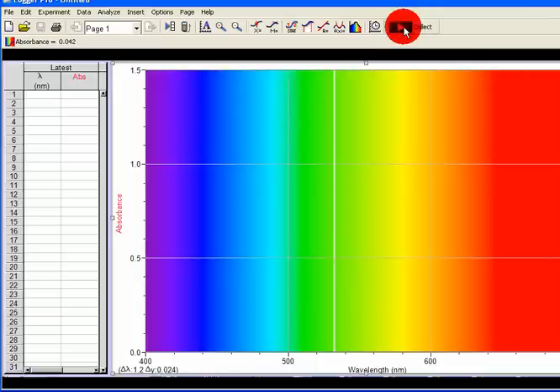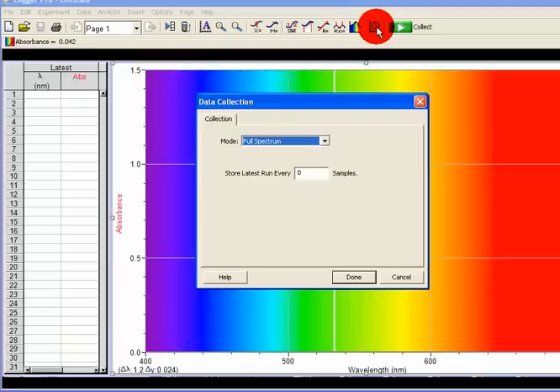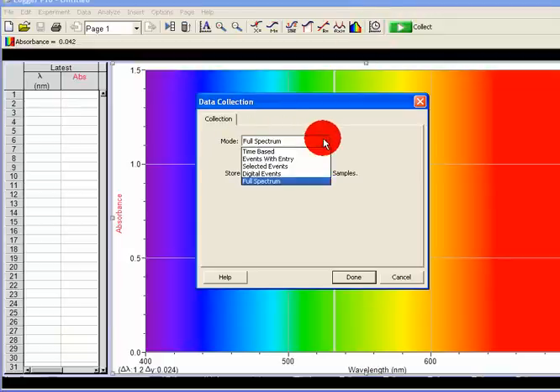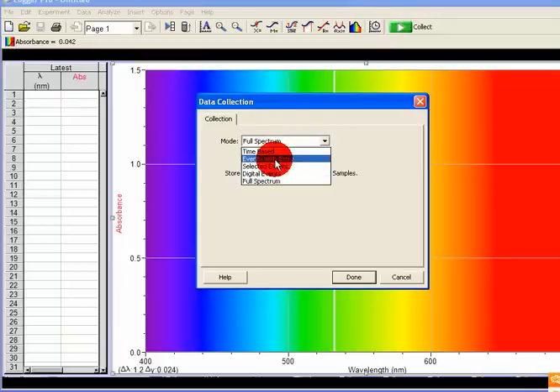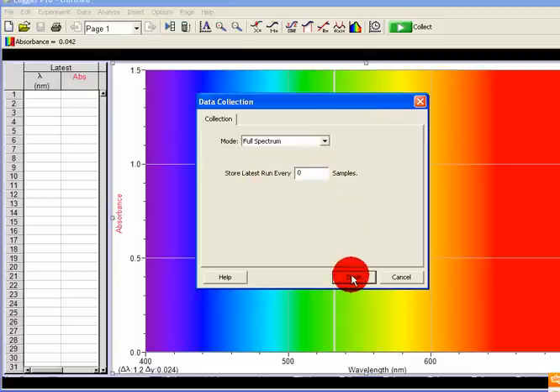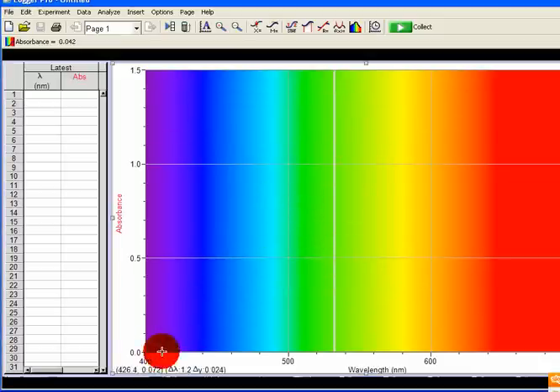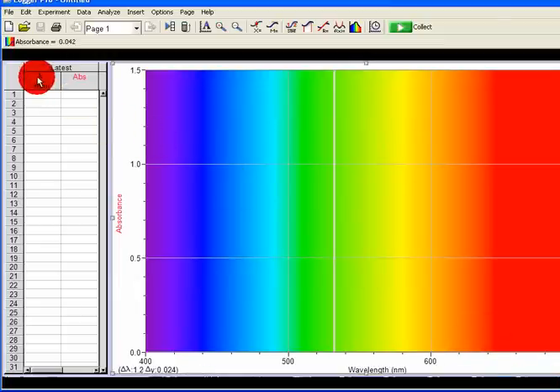We have a collect button here. This is the configure button and this is the data collection button. Click on it. This will be the full spectrum. Time, event with entry — select that one. So what we're going to do, we're going to use the full spectrum first. Click on done. This is a spectrum from 400 to 700. This is wavelength, this is absorbance.